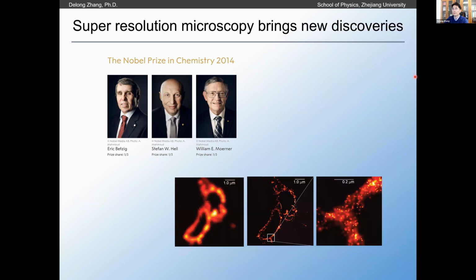First, if we talk about super resolution, of course, we will immediately think about the fluorescence-based techniques that received the Nobel Prize in 2014. And of course, nothing's perfect. They rely on specially fabricated fluorescent molecules, and there are issues including labeling efficiency and photobleaching.